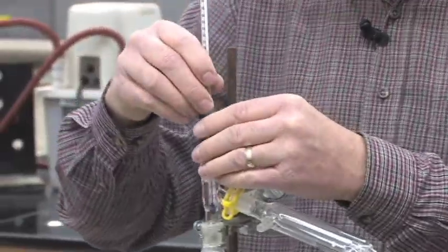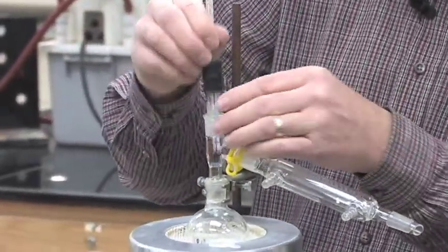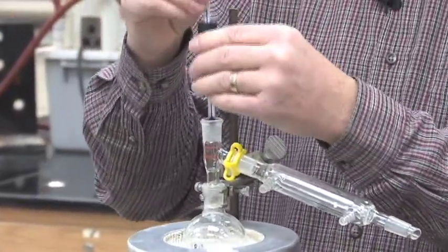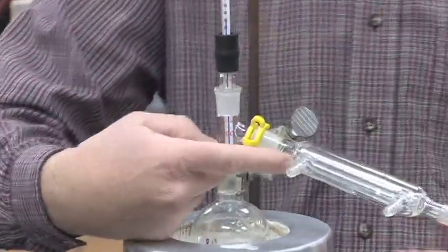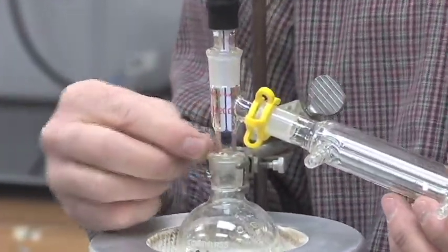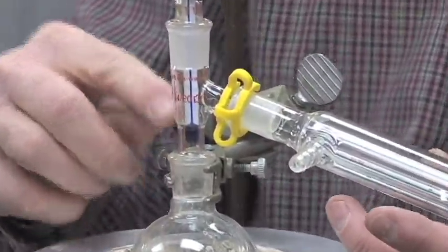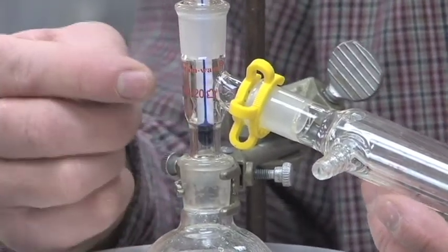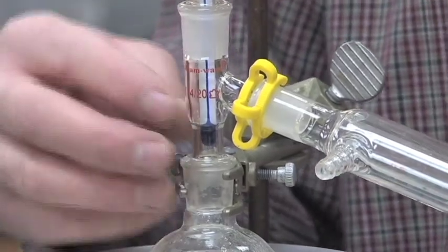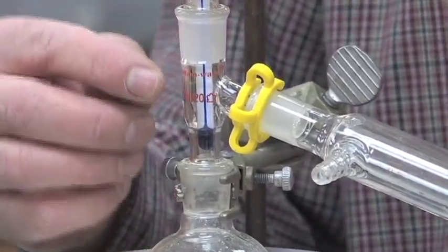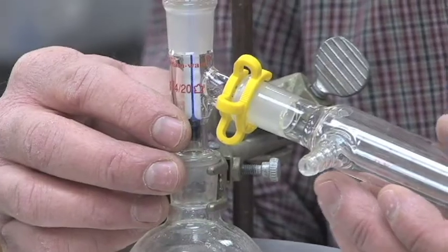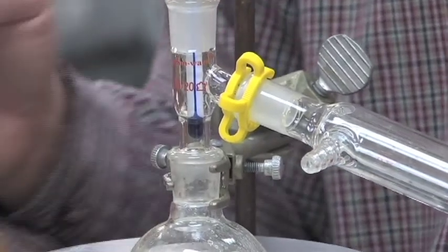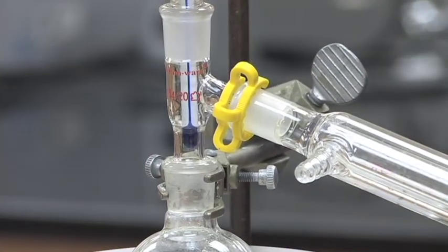So what we need to do is make sure the bulb of our thermometer is down below the arm going to the condenser in the setup. If the bulb is higher than up here where the arm comes off to the condenser, what will happen is your vapor is already starting to condense and you're not going to get a good boiling point temperature for your liquid that you're trying to distill.